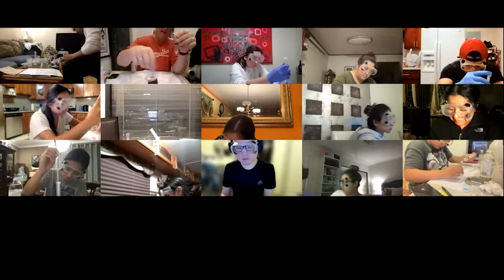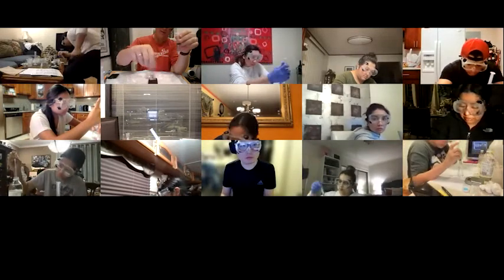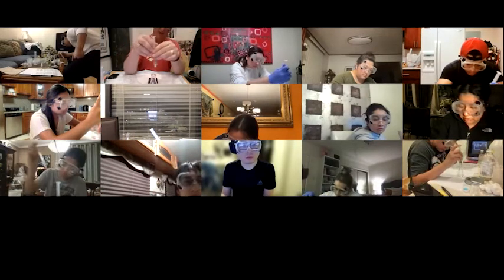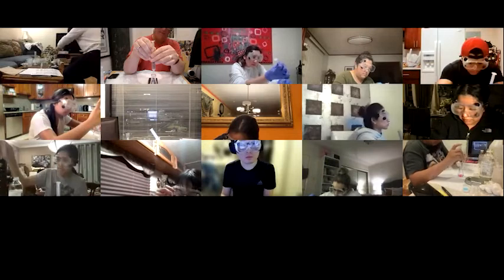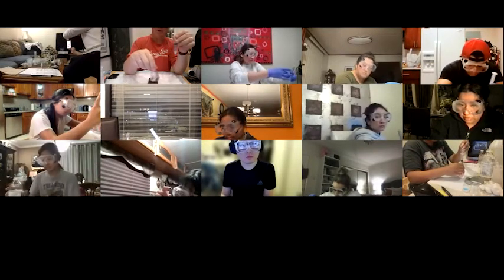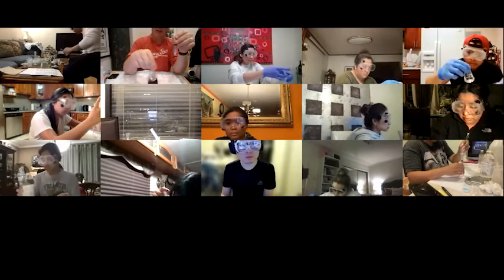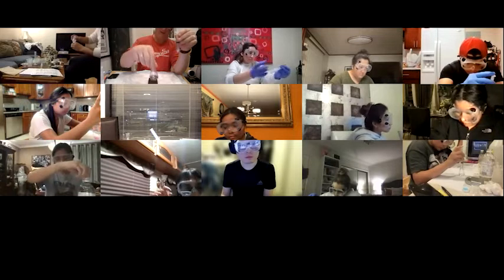Yeah, so now it's taking like 4 or 5 swirls to get rid of the color. So I know that probably 2 to 3 more drops and I'll have it. And you might actually get a purple. I'm getting a slightly purple color for some reason rather than pink. So maybe I didn't wash out my.